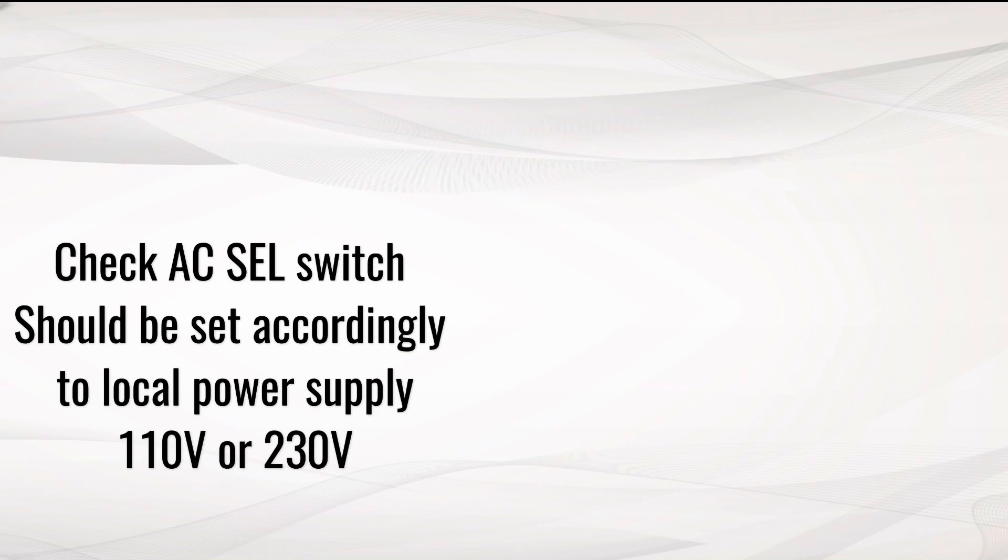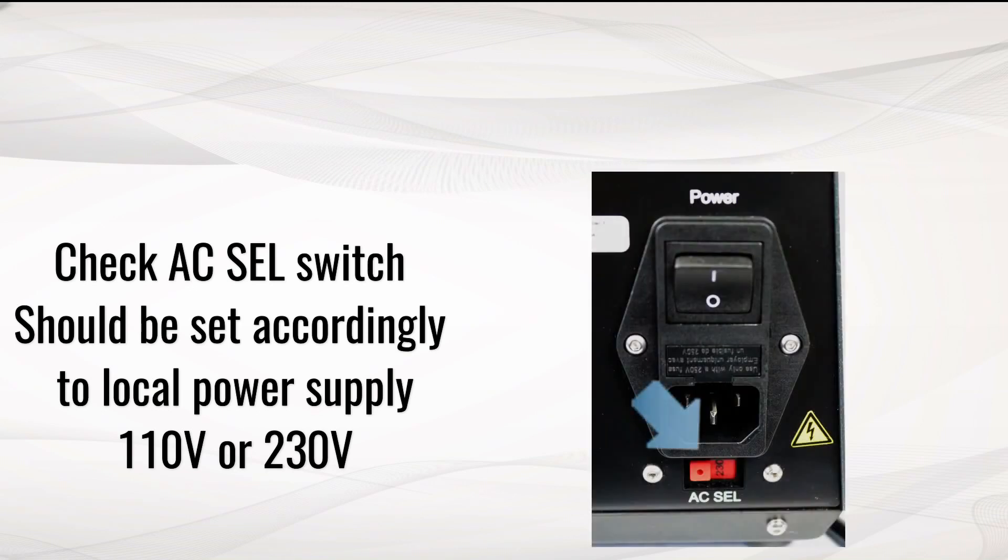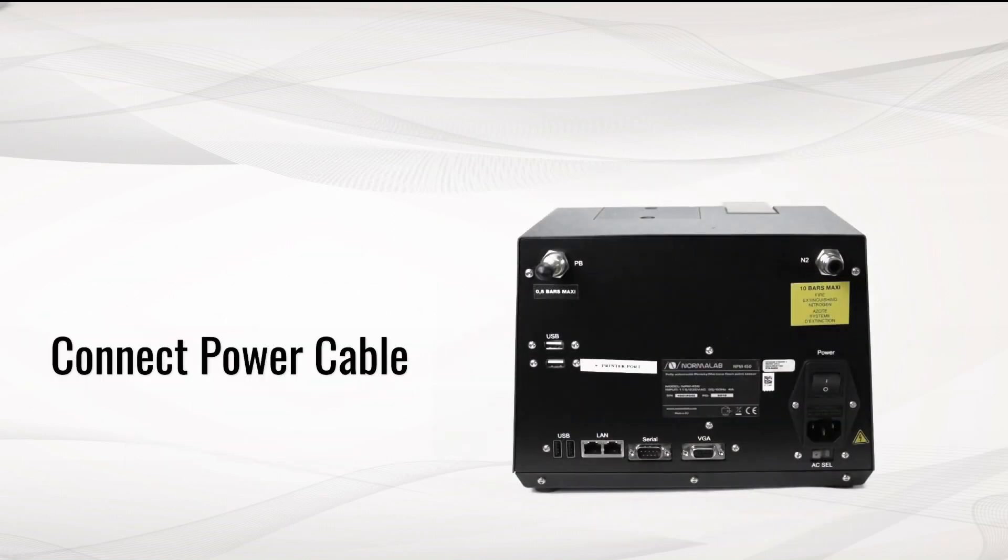For connecting your unit to power supply, check the AC selection switch for the right voltage. Connect the power cable.